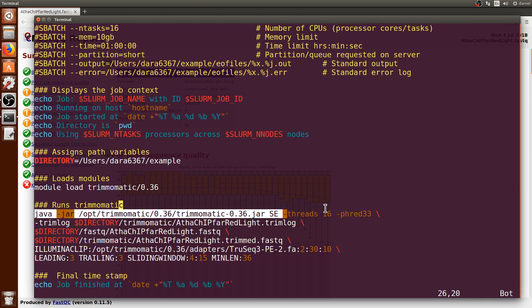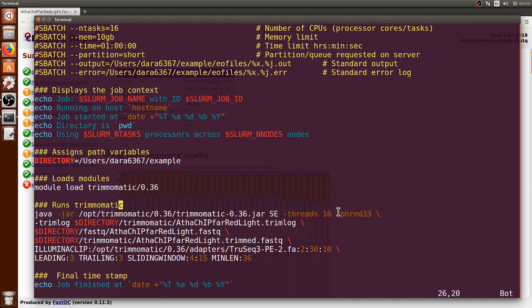We use SE, which stands for single end reads. We have to put how many processors we want or threads, in this case 16. Then the quality, which is the scale that comes from the FASTQ file, which in this case is Phred 33.